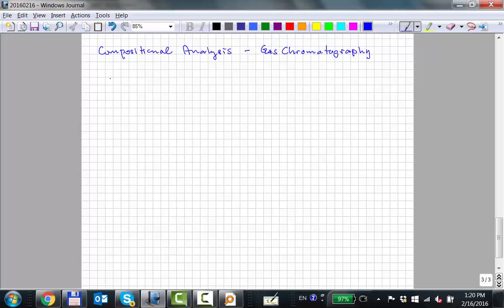The problem is that we have pressurized samples typically from 10 to 100 bar, potentially 1,000 bar is not out of the question, but certainly a 500 bar pressure range.